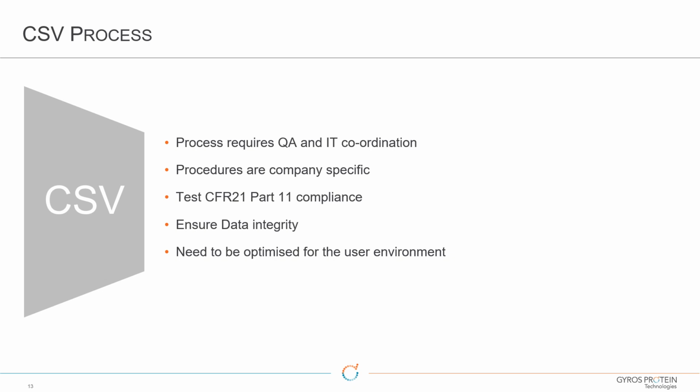And that's the other thing, the testing has to be done in the user environment. So on the network where the instrument's going to be operating. So anything that can affect how the data is generated is very important.